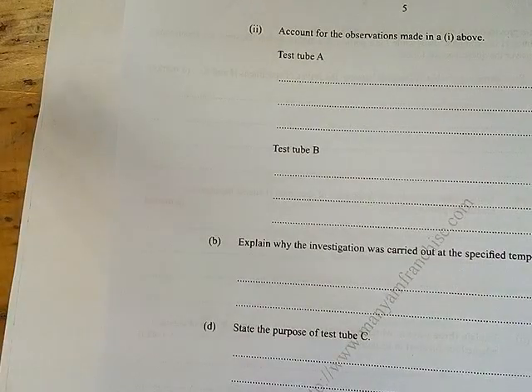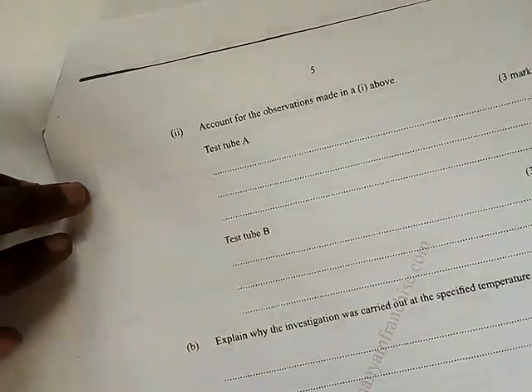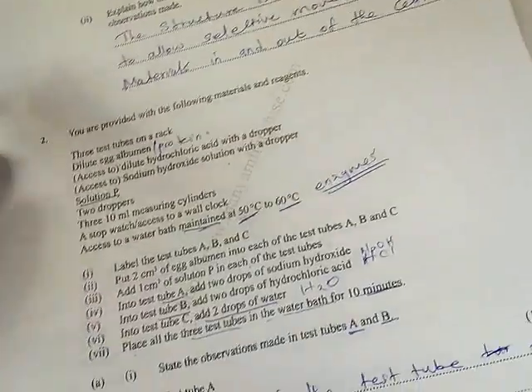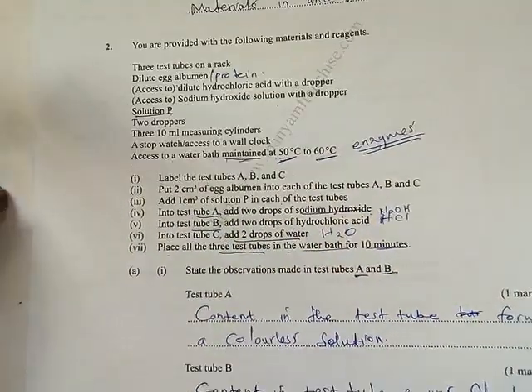Account for the observation in one above. The observation in test tube A: we added sodium hydroxide.